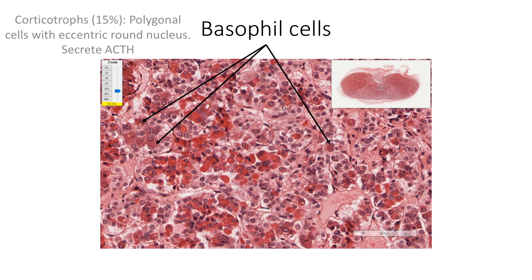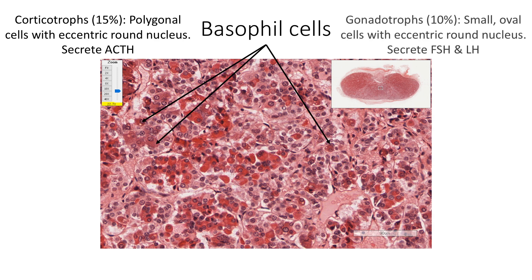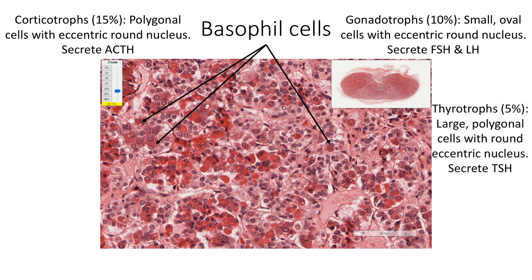Corticotrophs are polygonal, medium-sized basophil cells with an eccentric round nucleus. Gonadotrophs are small, oval basophilic cells with an eccentric round nucleus. Thyrotrophs are the least in number, forming only about 5% of the population, but they are large polygonal basophilic cells with an eccentric nucleus.